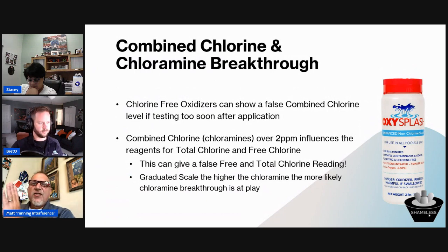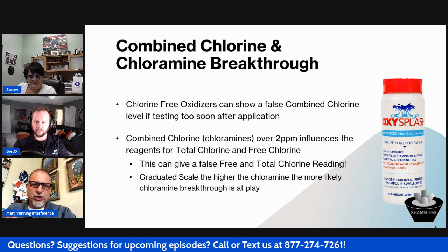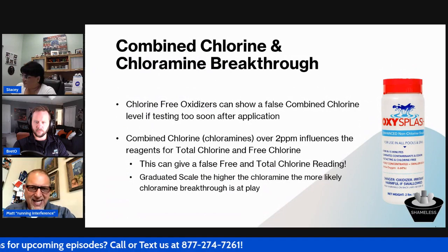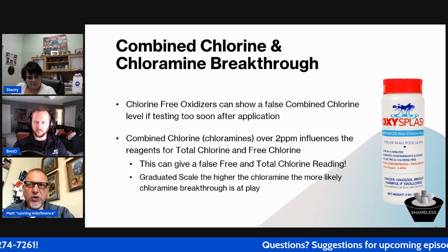Now, there's another phenomenon that has to do with that, and this is kind of going down the rabbit hole, but it's very important because it's very apropos for this season right now, and that is chloramine breakthrough. When the combined chlorine in a water sample gets to 2 parts per million or higher, and the higher past 2 parts per million, the more chance of this happening, you can actually have a free chlorine reading and a total chlorine reading read exactly the same because of the chloramines and what the chloramines do to the reagents. That's called chloramine breakthrough.